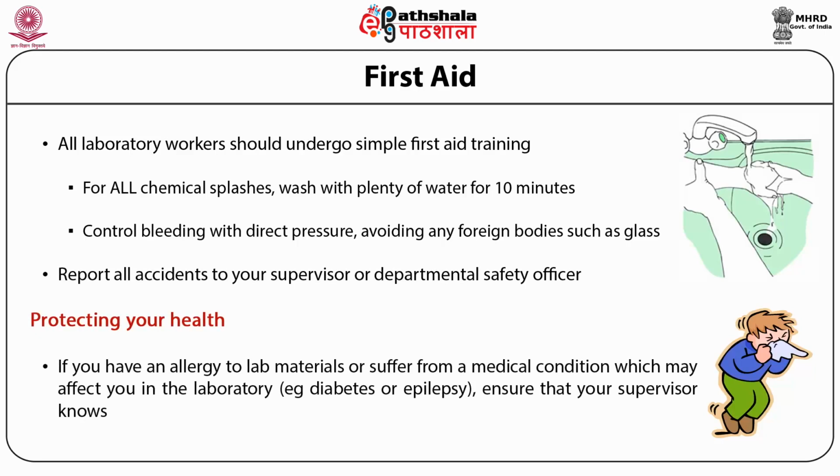If you have an allergy to lab materials or suffer from a medical condition which may affect you in the laboratory, for example, if you have diabetes or epilepsy, ensure that your supervisor knows about your health condition.